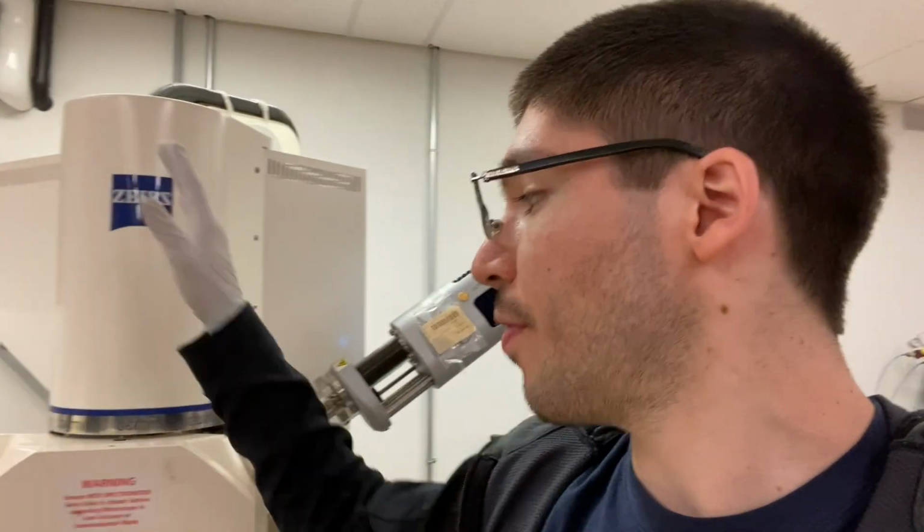I believe there's a book by Reed in 2005 that talks about the physics behind actually what the SEM is, what it tries to do, and electron microscopy as a whole, which involves interactions between electrons and atoms in your sample. And I could go on forever discussing this, but I would leave you to look at the book for more information. However, in terms of meteorite classification, we're just focused on this primary column interacting, forming backscattered electrons, and also forming characteristic X-rays that we can detect with our X-ray detector.